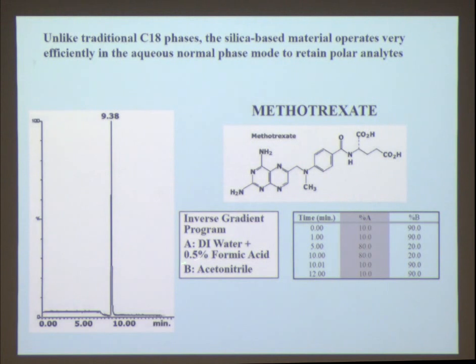formic acid. When we do this, you can see that the time of a compound not being retained would be down here about 1 minute. So this is over 9 minutes. This very polar molecule, even though the surface theoretically is modified by a very strong hydrophobic compound, C18, still retains in the normal phase mode. And I can guarantee you that any other C18 stationary phase made by organosilanization will not retain this molecule.